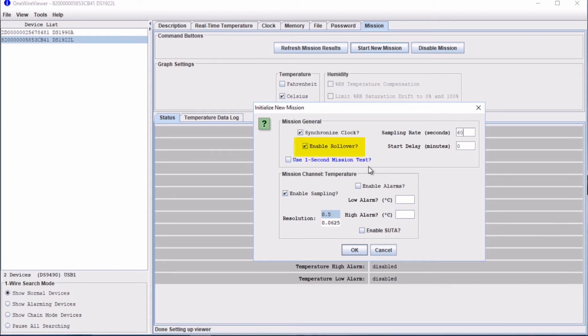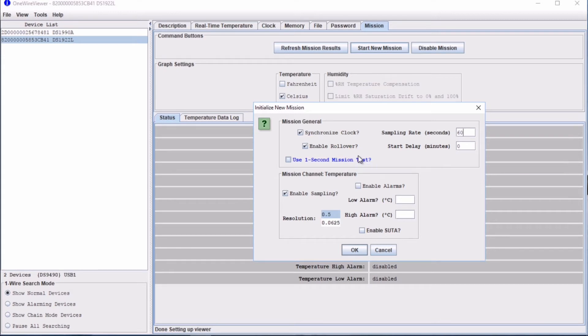One is Enable Rollover. If you tick this box, when the iButton's memory is full, the memory will be overwritten by new logged data. If you don't enable rollover, when the memory is full, the new values will just be discarded.